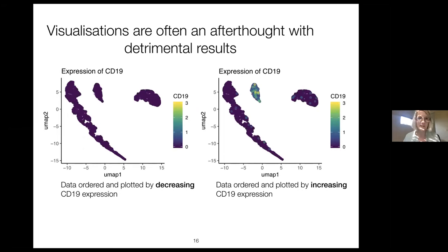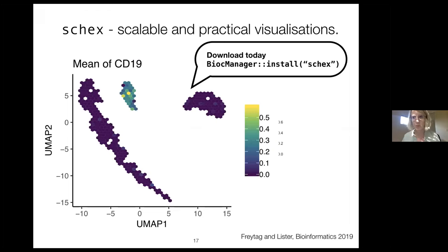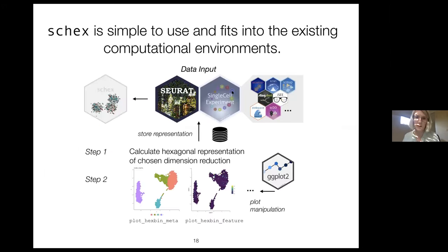I want to talk briefly about visualizations. Look at these two pictures of the same dataset — the only difference is data ordering. One is ordered by decreasing CD19 expression and the other by increasing CD19 expression. In one you wouldn't know the middle cluster is a B cell population, while in the other it's pretty clear. This overplotting becomes a major problem with millions of cells. So I developed SC-hex, which summarizes data points in hexagonal regions and gives you the mean value. You can install it via Bioconductor, and it works with both the SingleCellExperiment class and Seurat, so it integrates easily into your workflows.